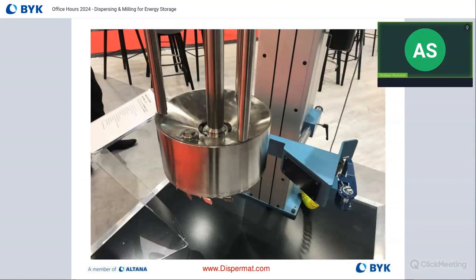Fully jacketed, it's double walled, so we have cooling in on the right. You see that bar, and then on the left, cooling out. And then we also have a third bar in the back that you can see a little bit in the background that holds the basket, but it's also used to measure the temperature. We measure temperature inside of our basket, so that is very, very cool.